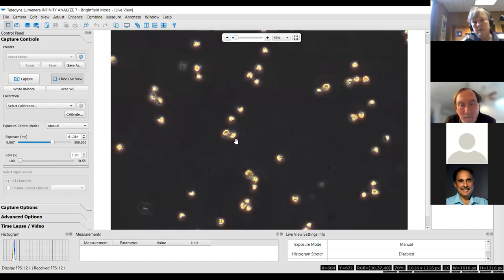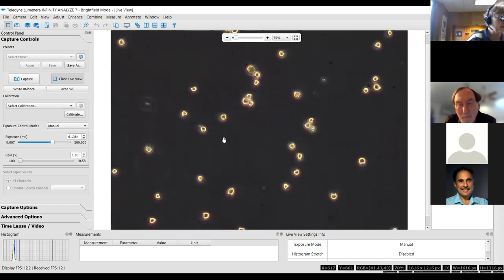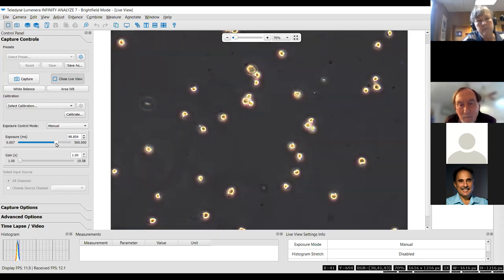And this is on phase. So these things are relatively small. This is actually a larger species. But what you see is that they're held in the colony very loosely. And so they actually move around a little bit in the colony, and the colonies are asymmetric from one side to the other. You can go back and look at the pictures in the lecture. And usually these have two unequal flagella. Often it will keep at least one of them, and so every once in a while, if you're looking enough, you can find one hanging off at the end, and then you'll see a lot of free ones in the sample. They drop them, they retract them, just to piss you off.